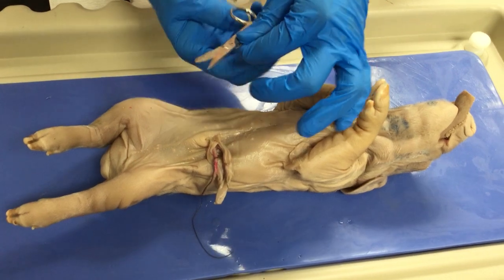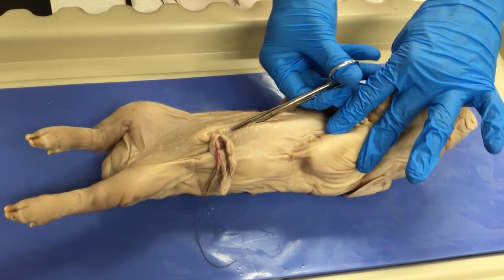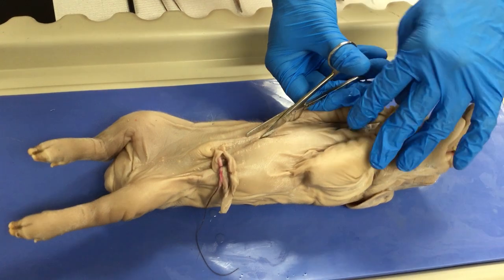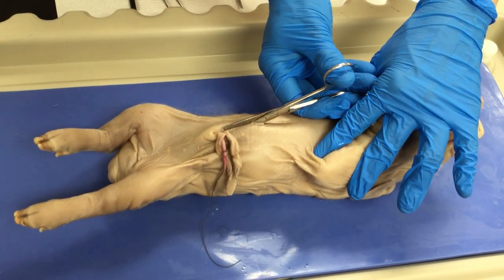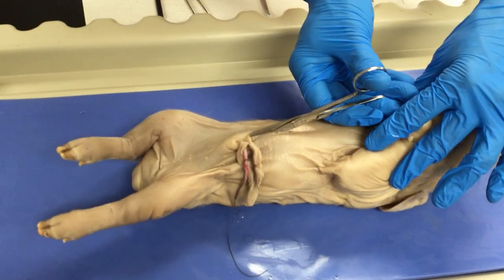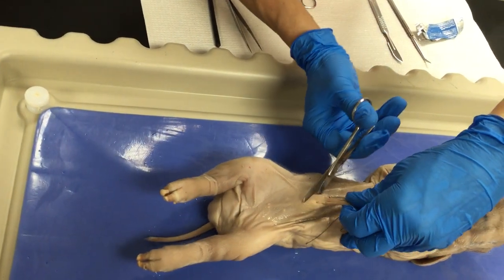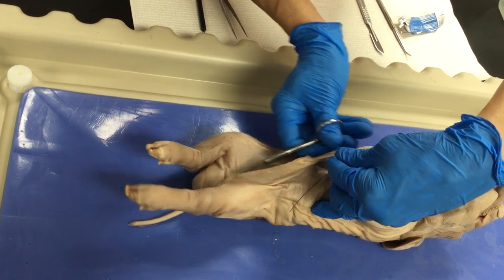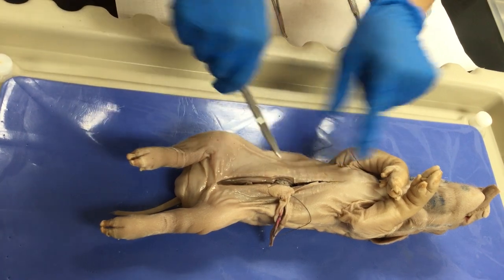When you are cutting, you can use the pointed tip and angulate it up a little bit so you won't damage anything. You are lifting the abdominal wall like this and going around the umbilical cord, just like this, continuing down to the pubic symphysis. And now we are at the abdominal cavity.